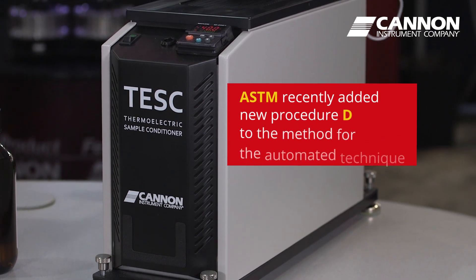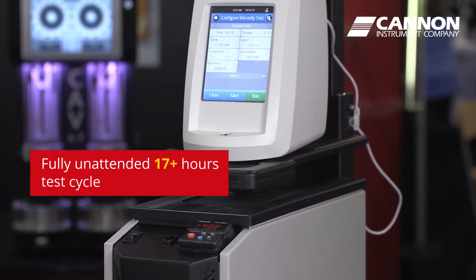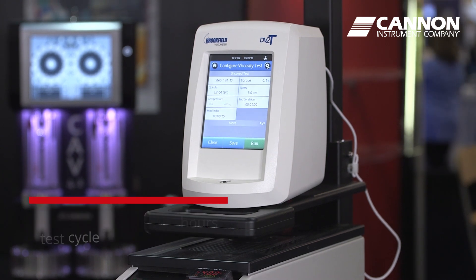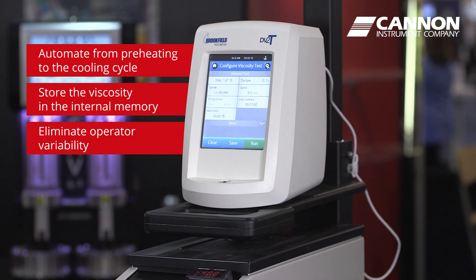ASTM has recently added a new procedure D to the method for this automated technique. It is fully unattended during the entire 17-plus hour test cycle, automating everything from preheating to the cooling cycle and then stepping through all of the speeds and recording the viscosity in the viscometer's memory. This effectively eliminates operator-to-operator variability and greatly improves precision.